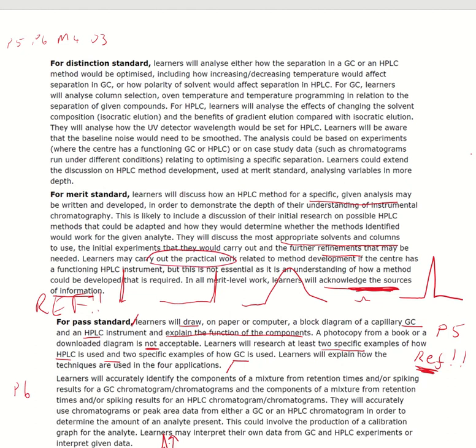Carrying out the practical work, no chance. I can't think of any college that would have easy access to an HPLC. So it's all based on a bit of theory, a bit of guesswork, and you talking about the possible things that could go wrong and how you would correct them.